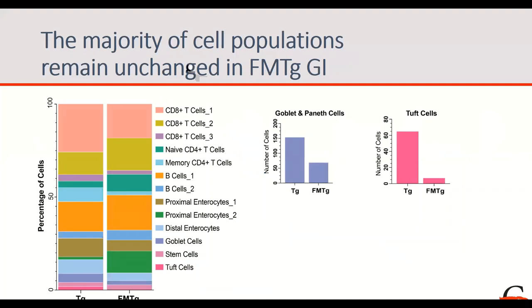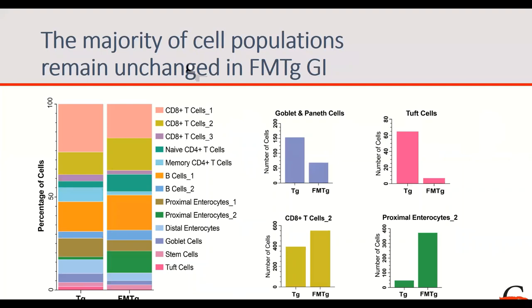This just shows the comparison of the population between two cell samples. Anyway, with single cell sequencing for each sample, we are able to identify how many different tumor cell types exist, which is extremely useful when we try to study tumor heterogeneity. Okay, so this is why single cell technology has gained high popularity.